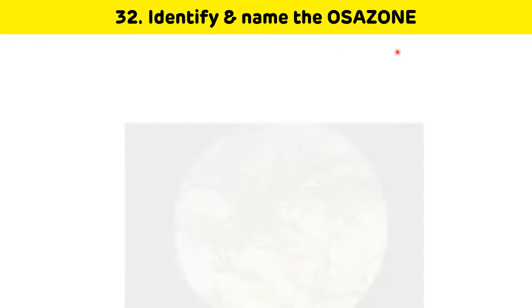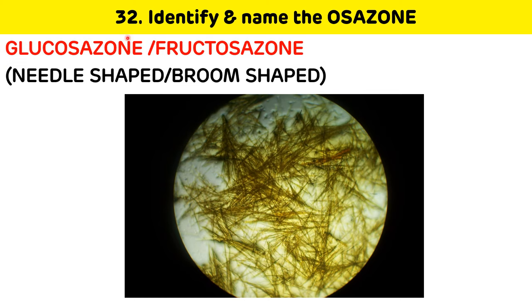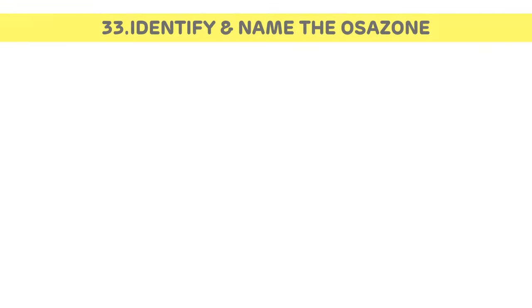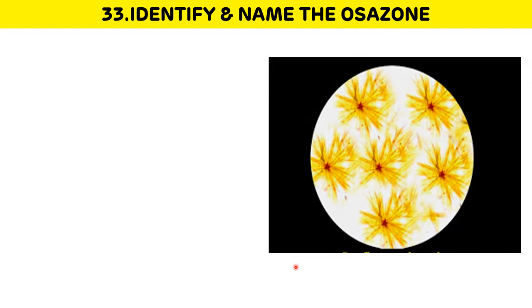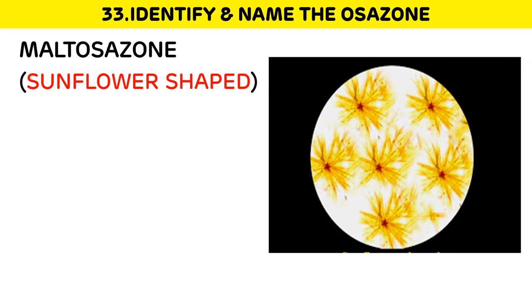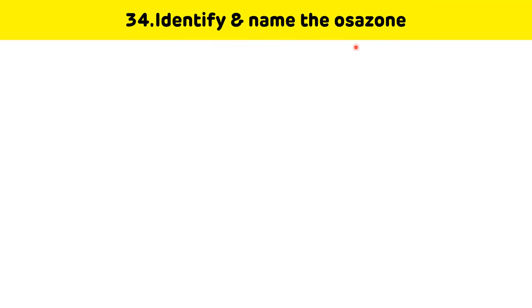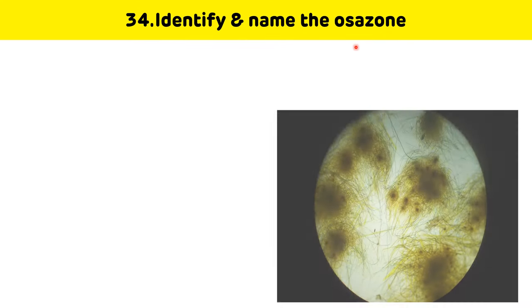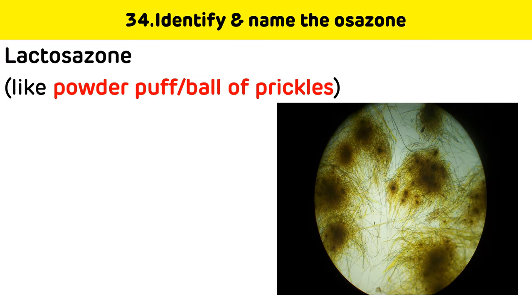Identify and name the osazone. These are needle- or broom-shaped crystals — this is glucose osazone or fructose osazone. These are sunflower-shaped osazone crystals — this is maltose osazone. These are powder-puff shaped osazone crystals — this is lactose osazone.